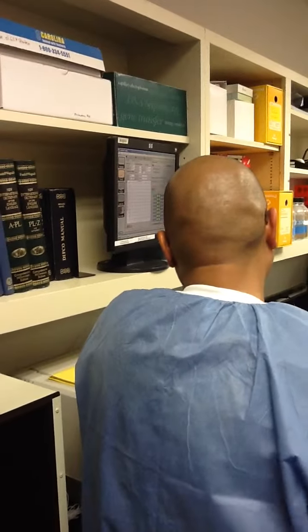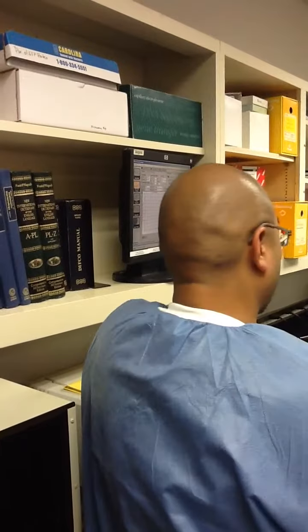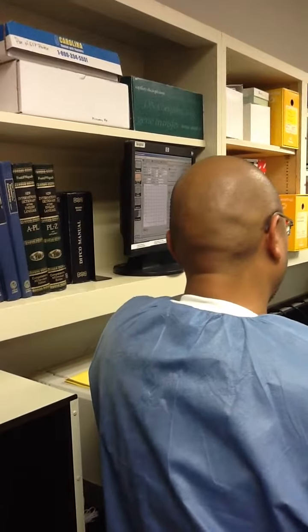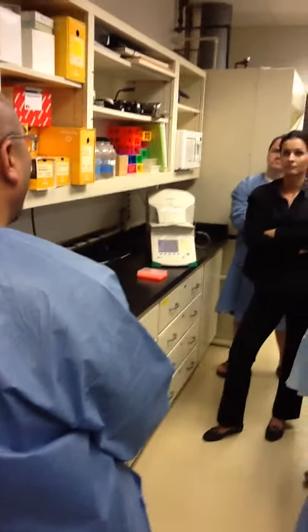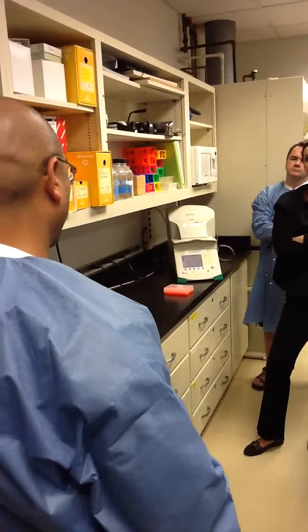The standard PCR for this is really quick. 3-step cycles, 30 seconds, 45, and 45. We're going to run this for 35 cycles and then see what we get at the end of that PCR mix. So sometime in the middle of the afternoon, we should get this data for the melting curve as well. We'll come in periodically to check what's happening and make sure that we get some signal amplified.